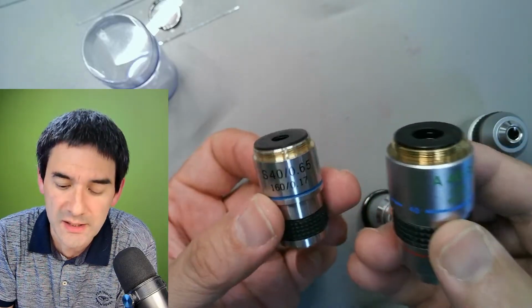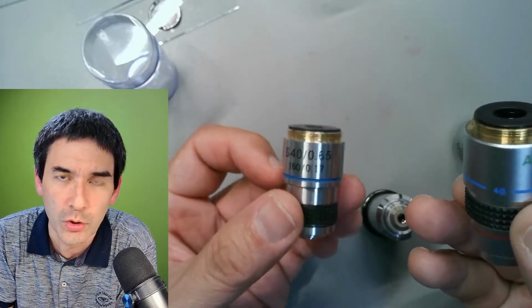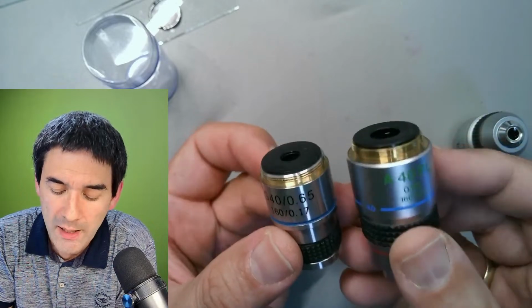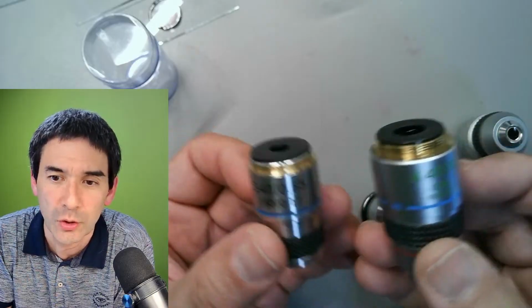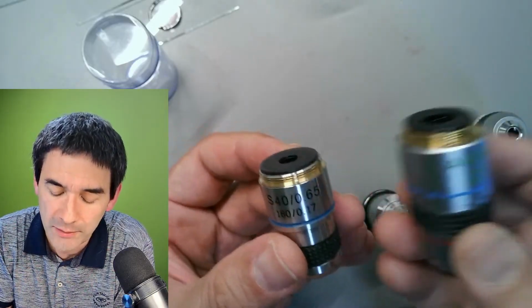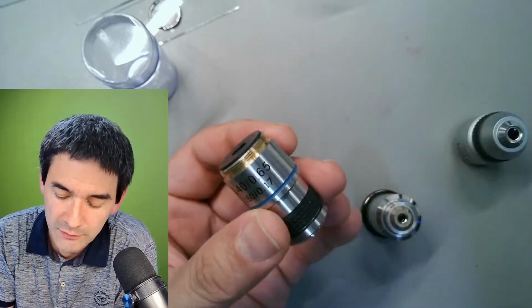The good news is I have not seen so many of those small short barrel microscope objectives around. However, when you buy replacement objectives, it's sometimes not indicated, and on the picture you sometimes don't see if it's a small objective or a large one. So this is something that I would like to share with you, that you have to take into consideration.